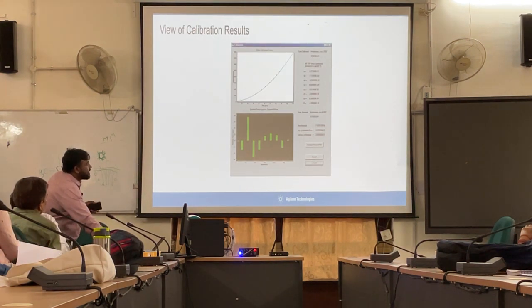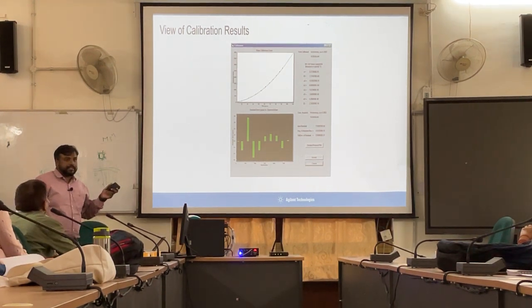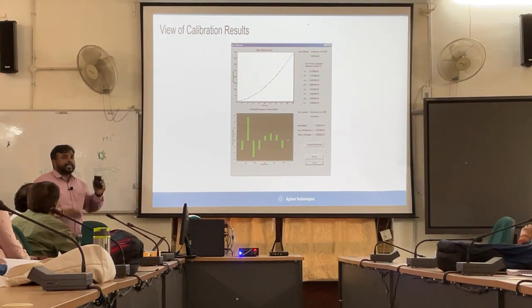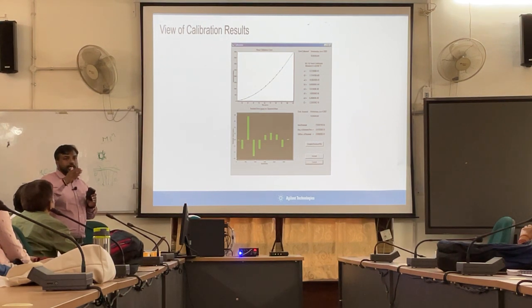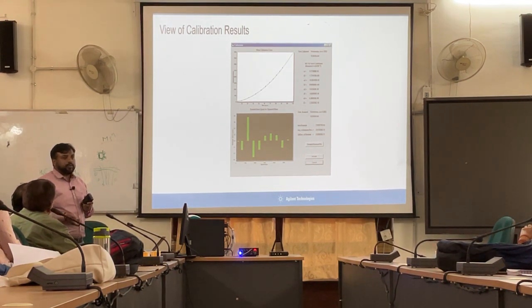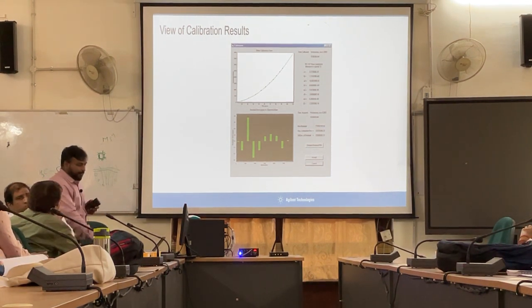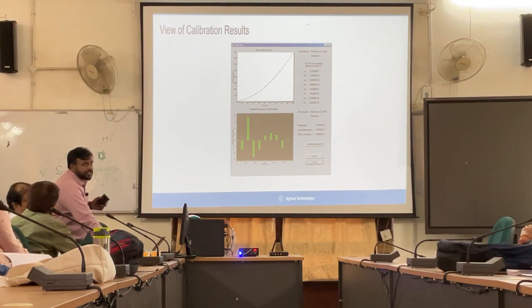After the calibration, this is actually old software where we were getting this kind of equation value, showing what exactly the time is going to be adjusted after the calibration of the instrument. But now we are directly getting reports where we get all the equation values in the report itself. And we will show this in the lab. We'll do this kind of activity in the lab.